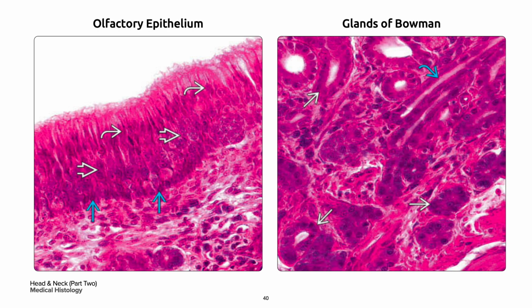On your left is an olfactory epithelium that contains bipolar olfactory nerve cells with their nuclei in bold white arrow, stratified between the more uniform superficial nuclei of the ciliated columnar supporting sustentacular cells in curved white arrow and the progenitor basal cells in a blue single arrow shown here. No mucous cells are present in the olfactory mucosa.